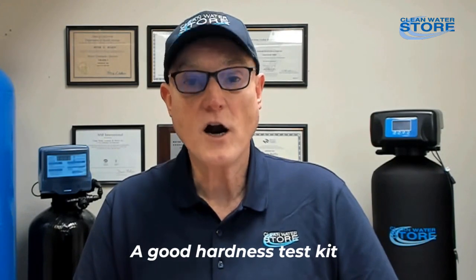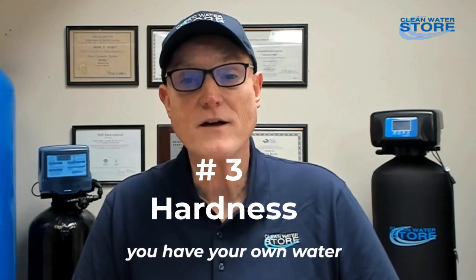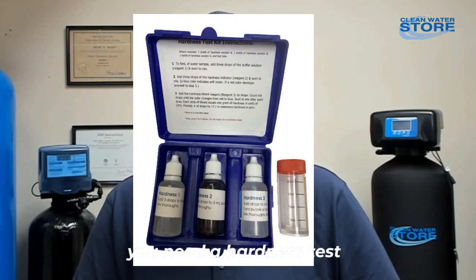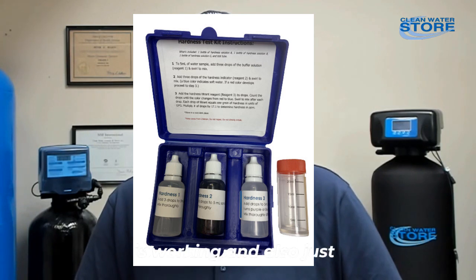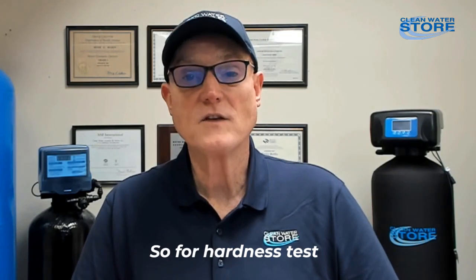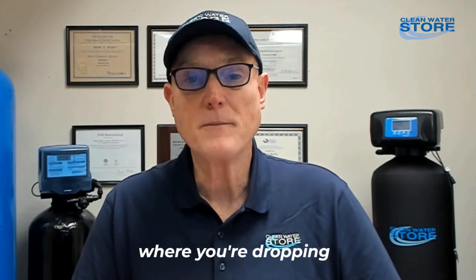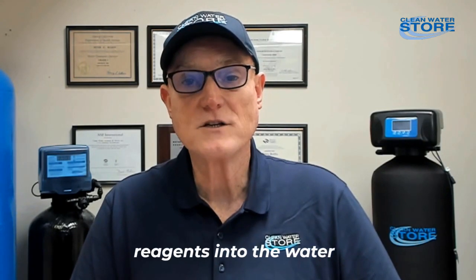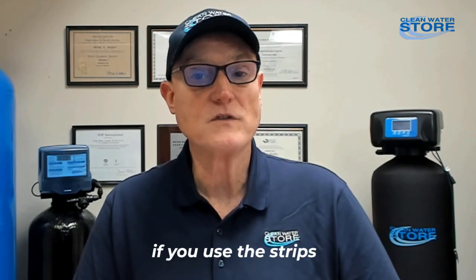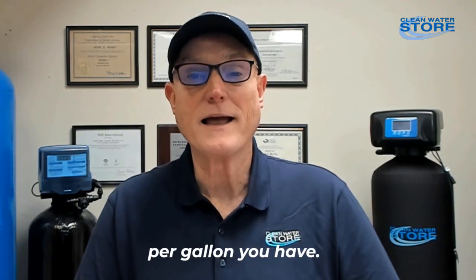The third one is hardness. A good hardness test kit is essential if you have your own water well. Unless you have naturally occurring soft water, you need a hardness test kit to see how your water softener is working and to find out if you even need one. An inexpensive drops test — where you add drops of different colored reagents into water in a test tube — gives the most accurate results, because you can count the drops and find out exactly how many grains per gallon you have. With strips, you only get a range, but for hardness you really want to know the exact grains per gallon.